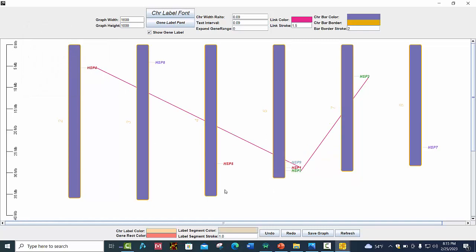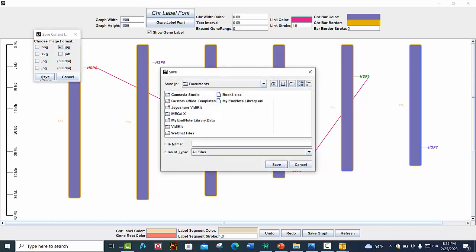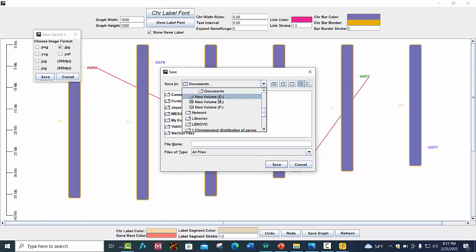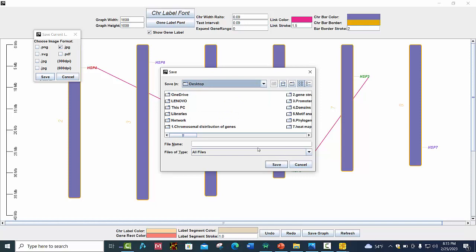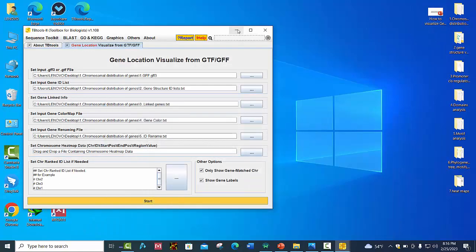After making your desired changes, you can save this graph by pressing the Save Graph button. You can choose whatever format you want, like JPG or PDF. Select where you want to keep your file — for example, the desktop — and give it a name like 'Gene Location on Chromosomes', then save it.